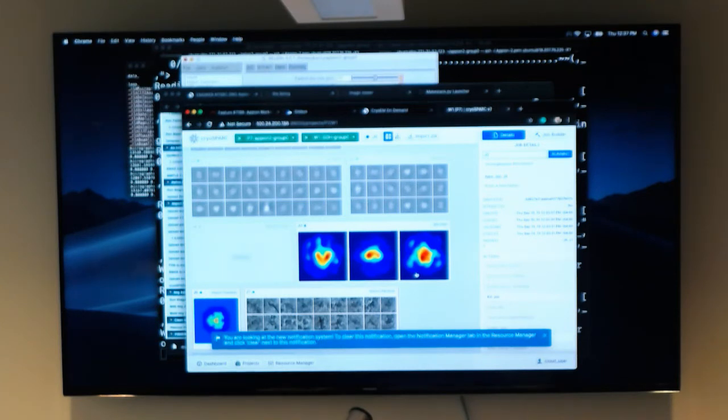Again, the reason being is the assumption is you've already done Appion part 1. We actually even have done the initial Relion part. This is just springboarding into Cryosparc. So this is the star file. You can take the star file directly. You can take the binned or unbinned, doesn't matter.